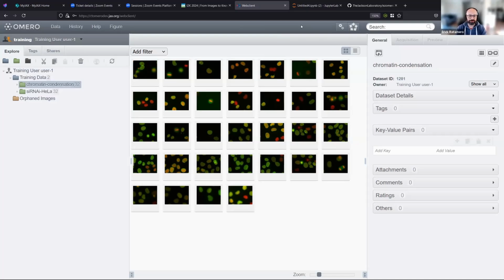All right, questions? No questions? Okay. Conventional file size limits for individual images. There are none. In our internal server, we have lots of cases of individual whole slide images that are multi-gigabyte in size, and they just work.